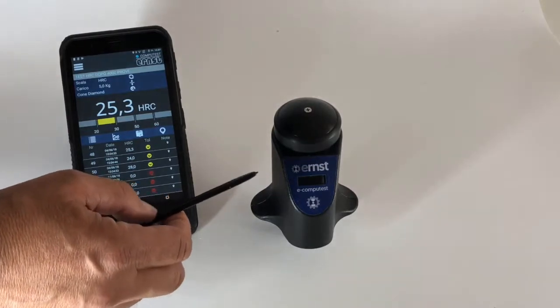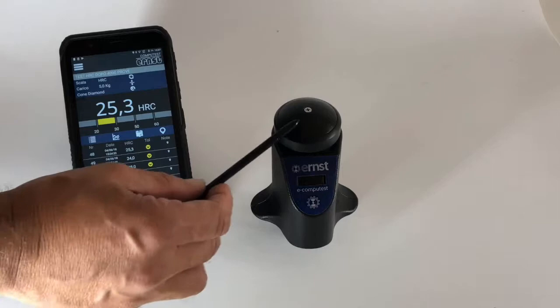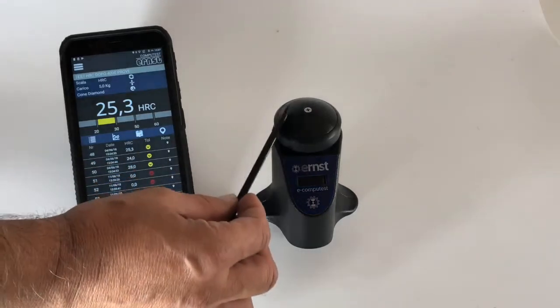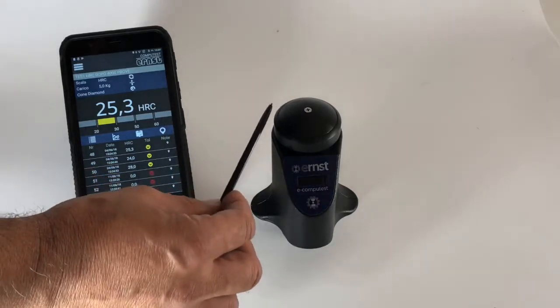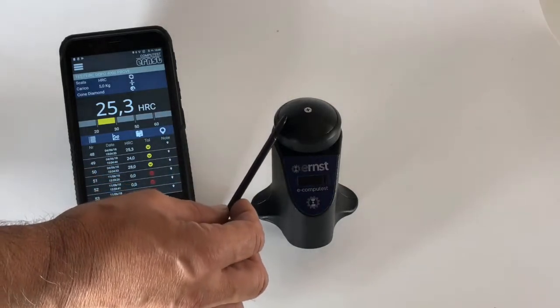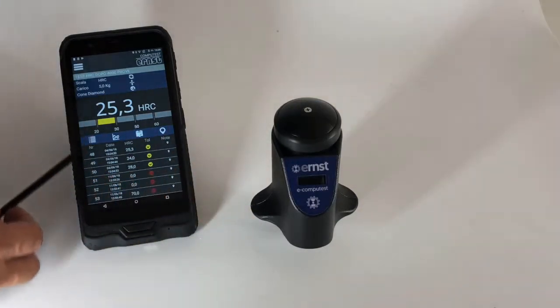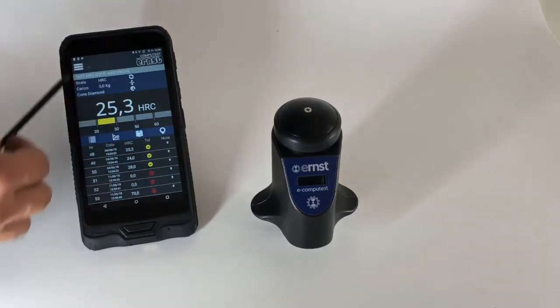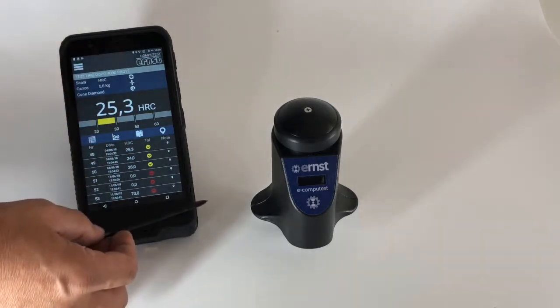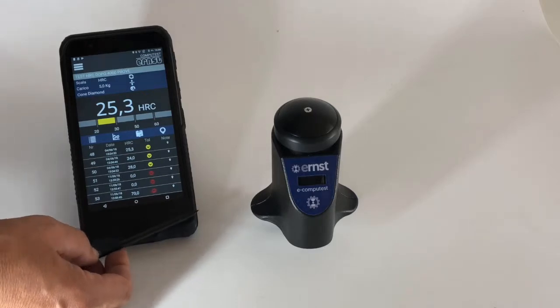It becomes much easier to use. This is also a wireless unit — you can transfer data to a receiver unit at a range of up to 100 meters, which is very useful in the field.